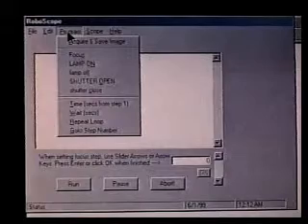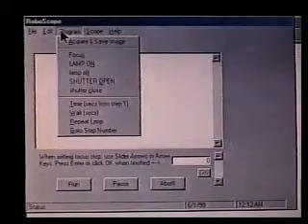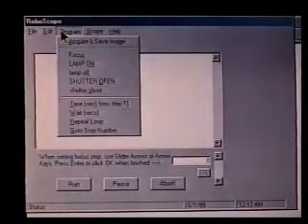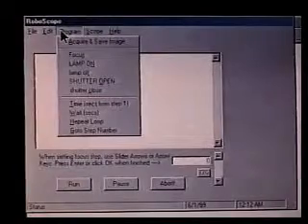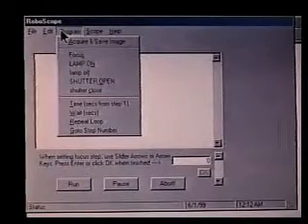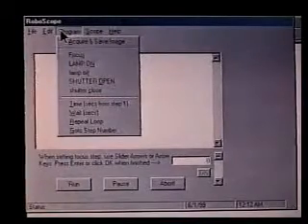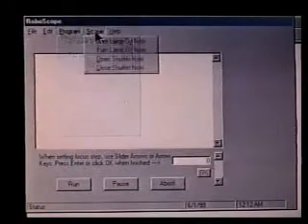The Program menu has all the different program steps that you can use in writing a Roboscope program, which we will use for our program.